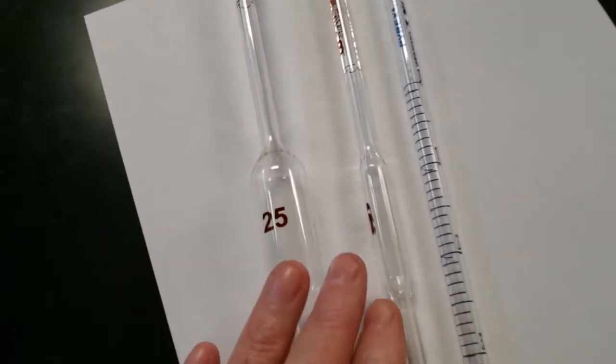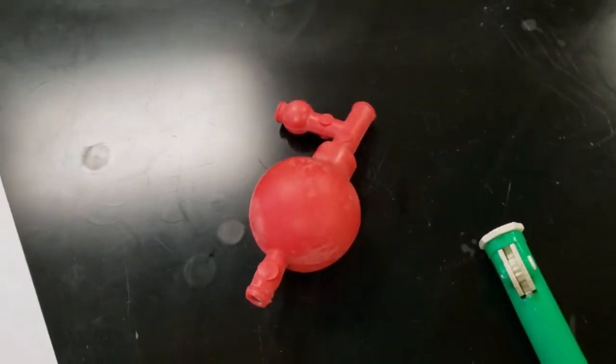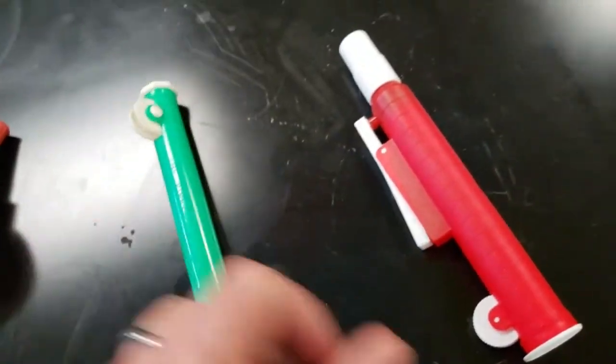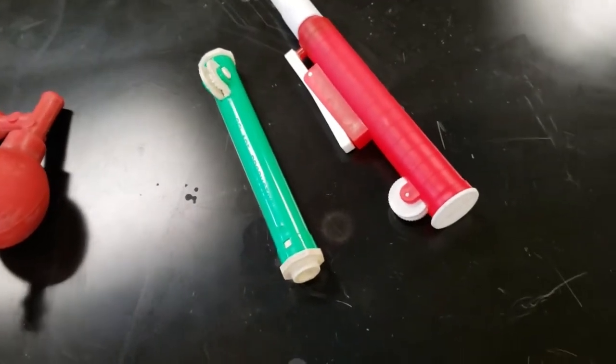These are pipettes. The two on the left are volumetric because they measure one volume. They have one line. The one on the right is a graduated pipette. A pipette is simply a glass tube. And in order to pull the liquid up into the pipette, we're going to use this pipette bulb or maybe this pipette pump, the green one. The green one can pull up 10 mils while the red one can pull up 25 mils.